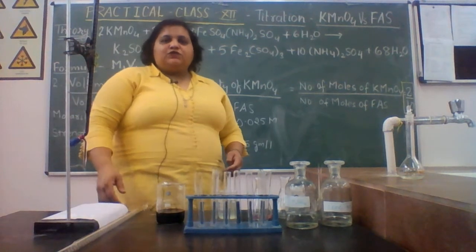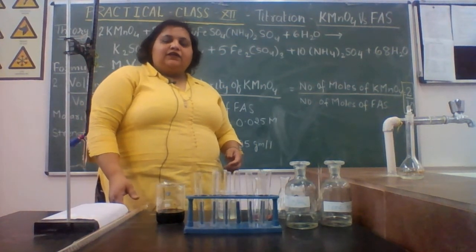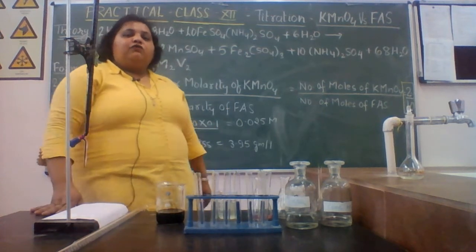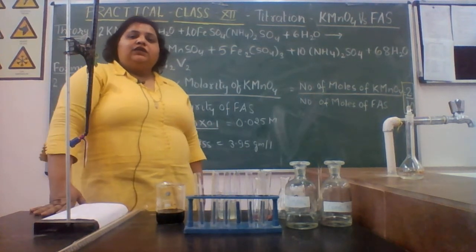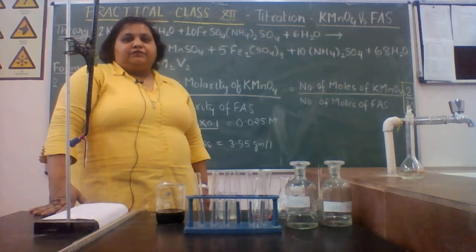Good morning, dear students. In the last class of practicals, we have learnt the first part of the titration, that is the preparation of a standard solution.